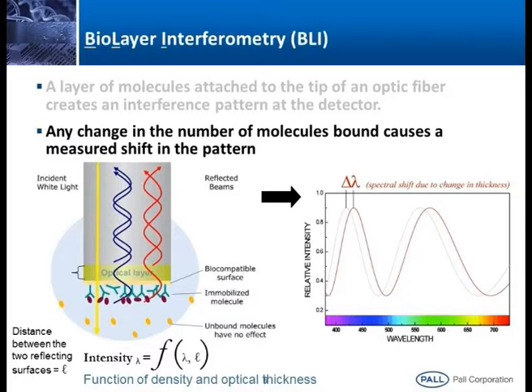So, if you look at this diagram, the antibody starts binding to this ligand. Earlier, there is a constant reflection from the internal optical layer. Now, there is a reflection coming from here. If you look at this, the path length increases. Earlier the light was coming from here, now the light is reflecting from here.